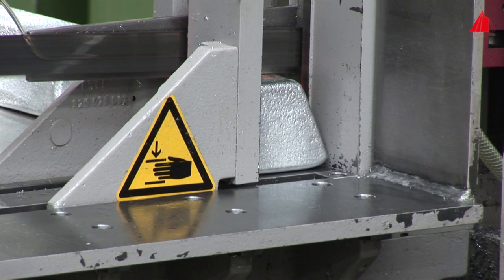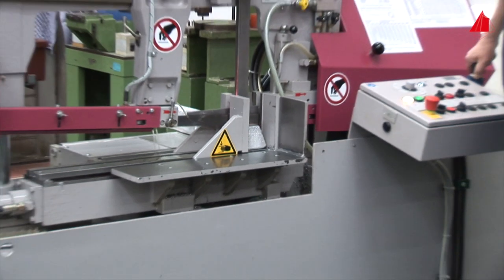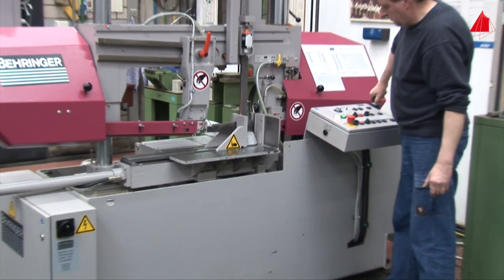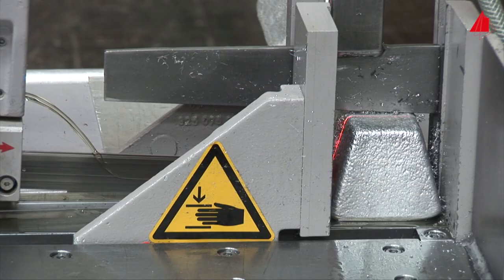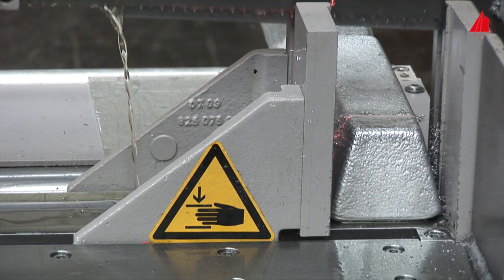Then the bandsaw gently sets onto the block and cuts it slowly under intensive liquid cooling. It is important to keep the material as cool as possible to avoid changes in the material structure. That's it! The ingot has been sectioned.